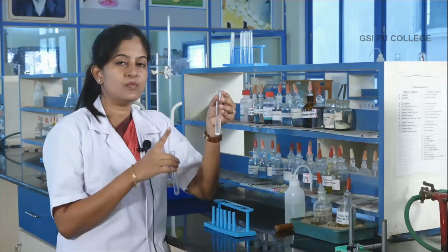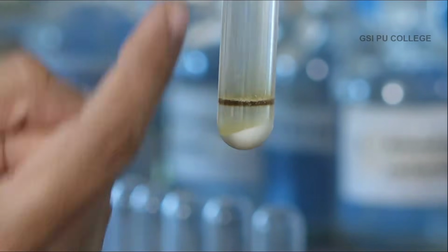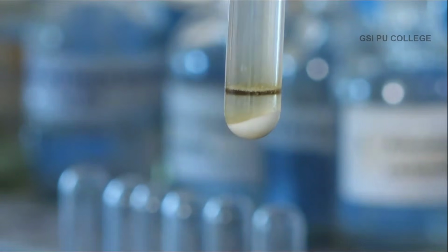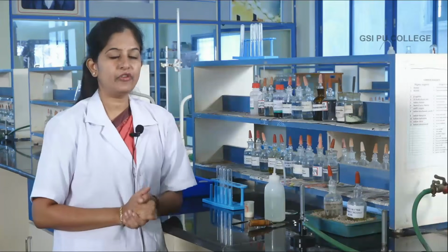Now, keep this mixture aside for a few minutes. So, after resting the solution for some time, you can observe there is a brown ring at the junction of two liquids. At the junction of the liquids, you can observe a brown color ring which confirms that the acid radical present in the given salt is nitrate. So, now we have confirmed the acid radical is nitrate.